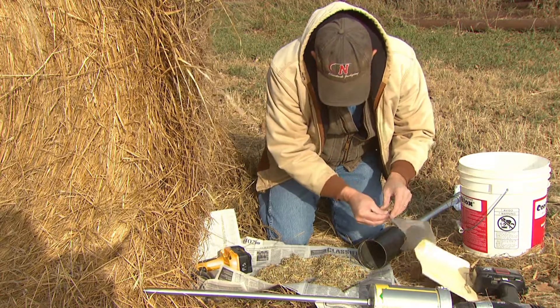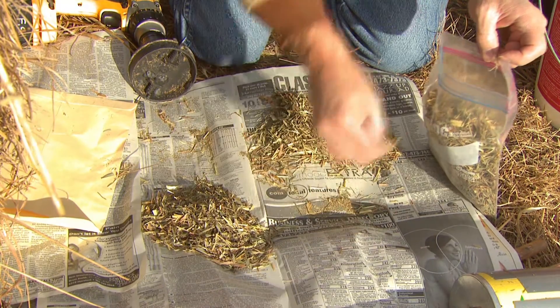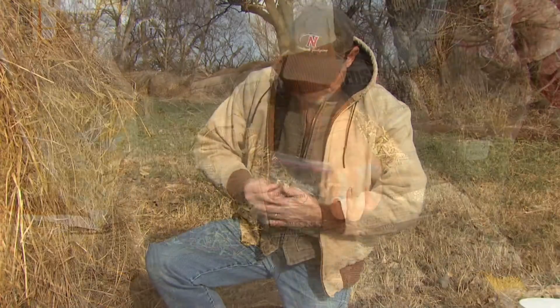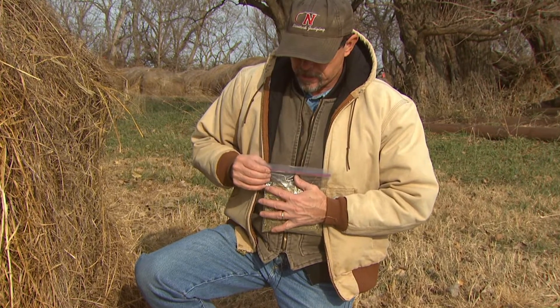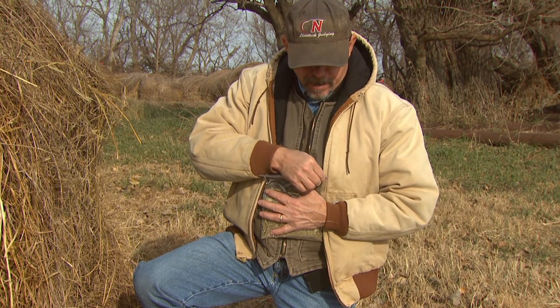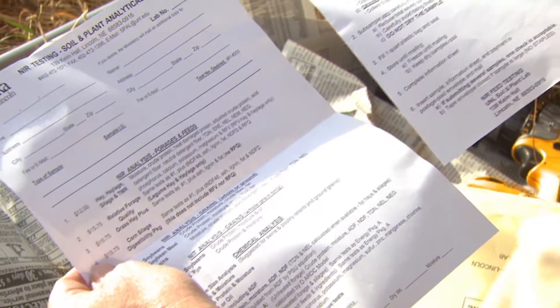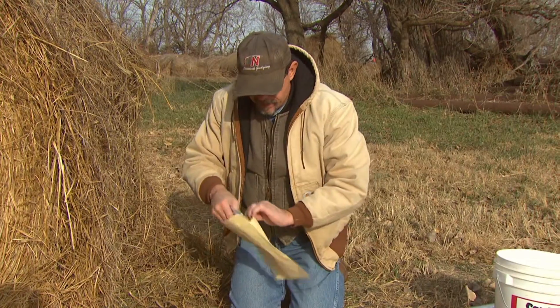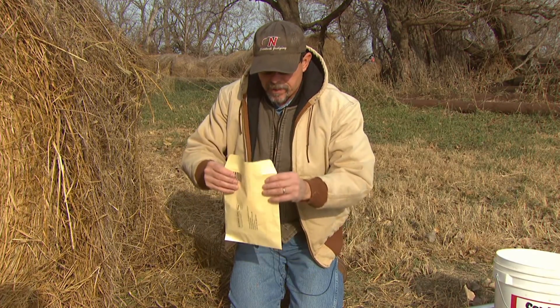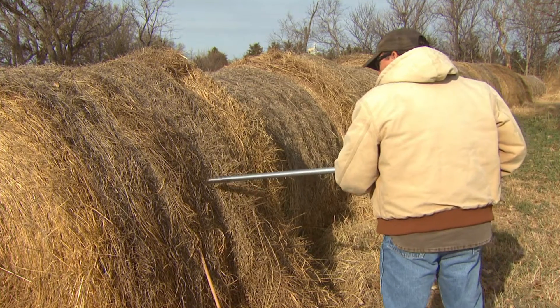Determine if the amount fits into the plastic bag; if not, repeat the quartering procedure until the sub-sample fits. Extra caution must be taken when sub-sampling hay, as some of the fines may be lost. Squeeze the air out of the plastic bag and seal it. Label the bag with your name, address, lot ID, and type of material. Most testing labs provide a description sheet to report this information and request the desired tests — fill it out accurately and legibly.